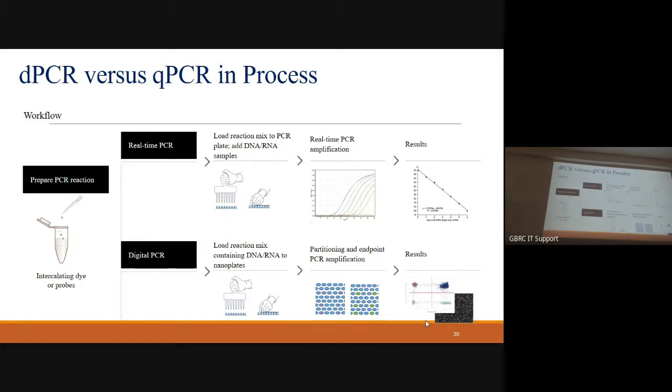Firstly, you need to make the reaction mix with your sample and your oil, and then your droplets will be generated in an 8-well cartridge. So individually for each of the 8 wells you need to generate the droplets, and then separately you put these generated droplets from your PCR master mix into the PCR plate. So this is a 3 different kind of system they have provided.